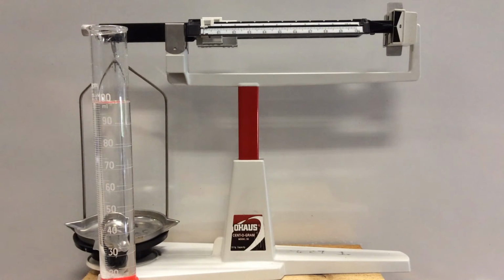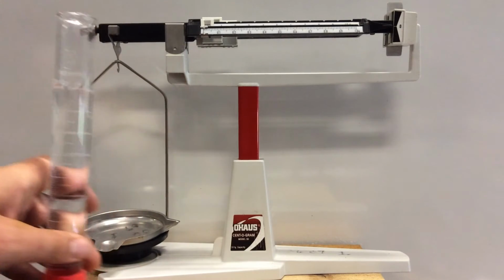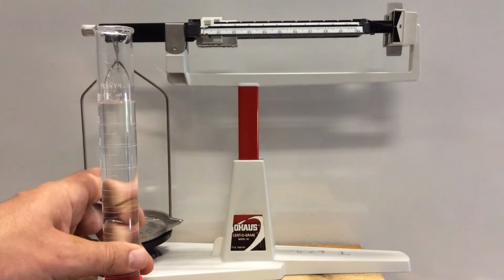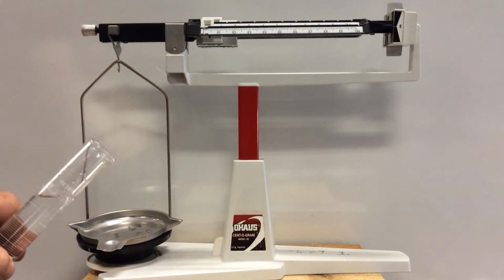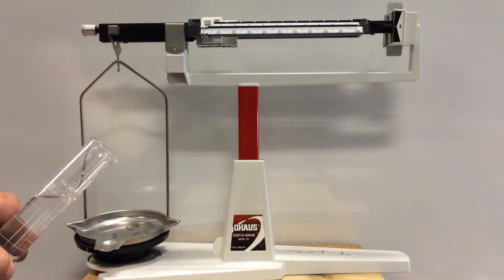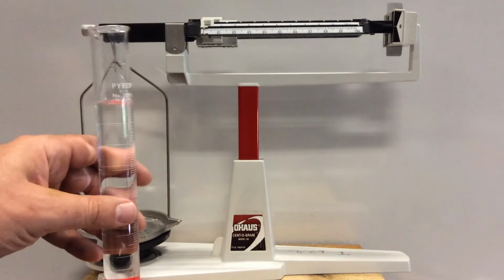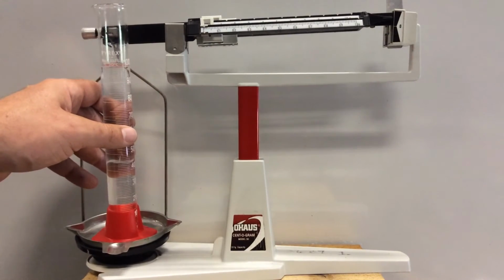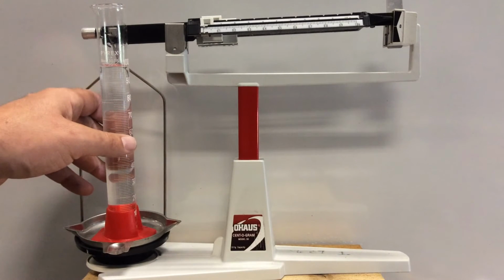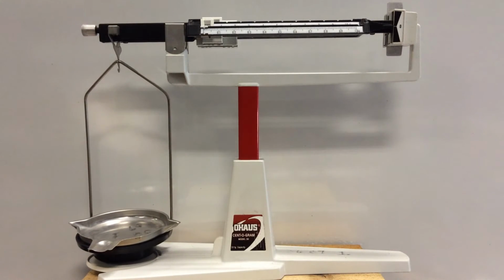Now, how do I measure the mass? Well, believe it or not, I've had students do this. They would actually zero out our balance like it is right now, all the riders to the left, and they begin to pour the liquid and then try to find the mass as they poured, and that's of course not what we do here. So you could try to put this on here, but because it's leaning and some of the mass is being used to lean up against this, that would not be a very accurate way to do this. So what we do and employ in physical chemistry labs, we have containers.